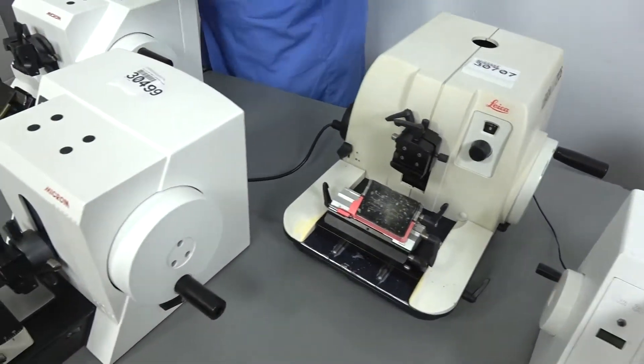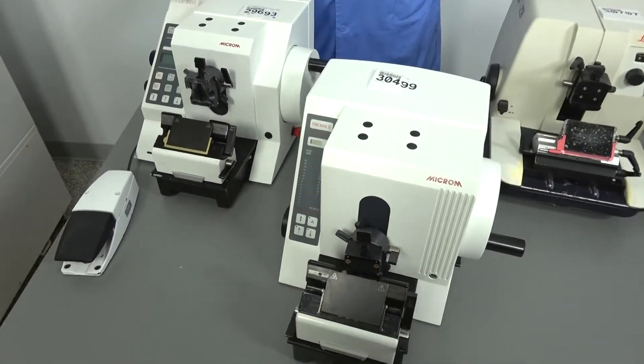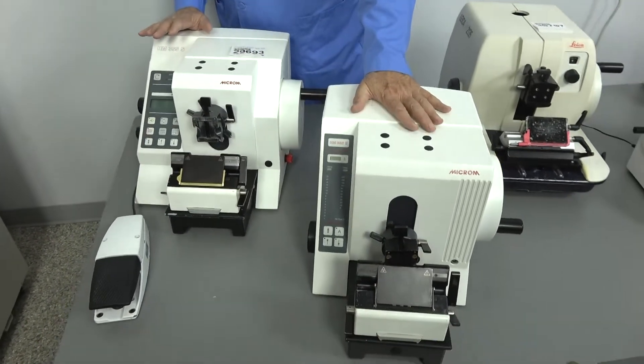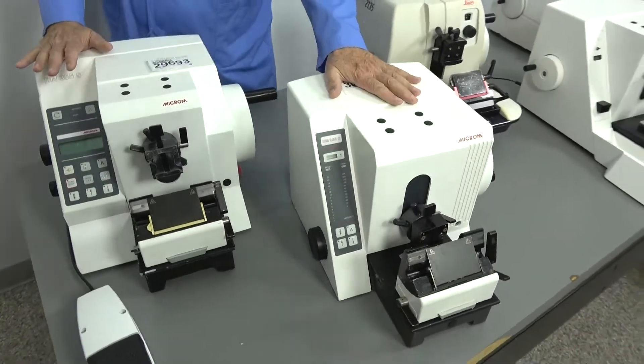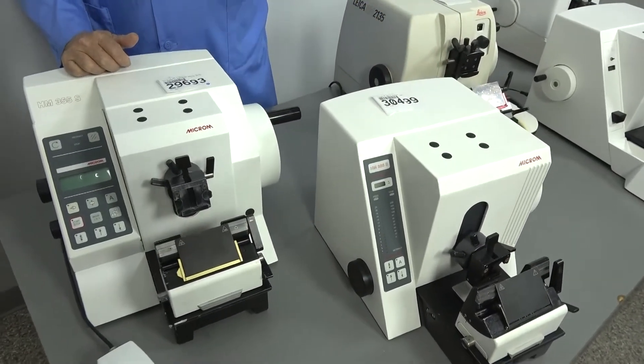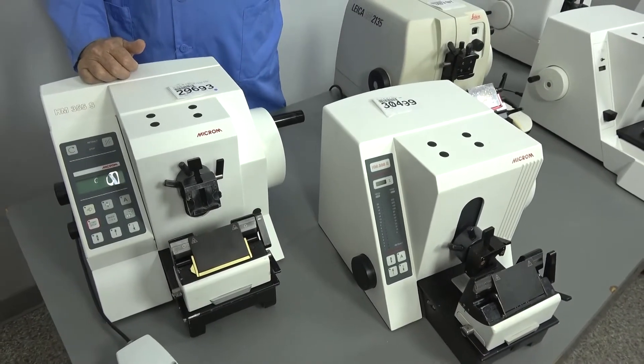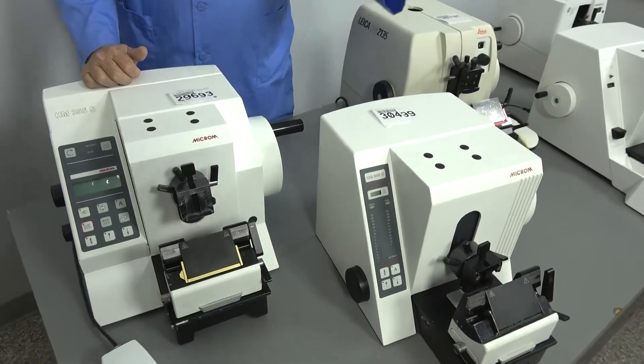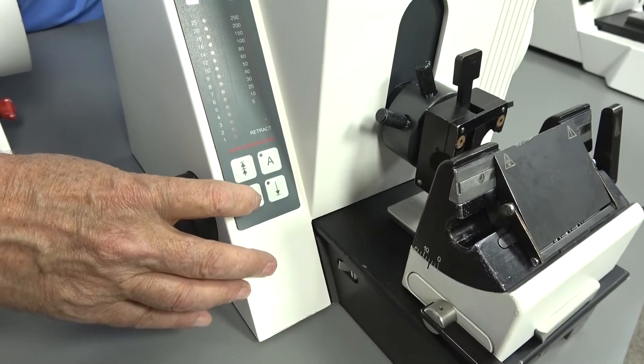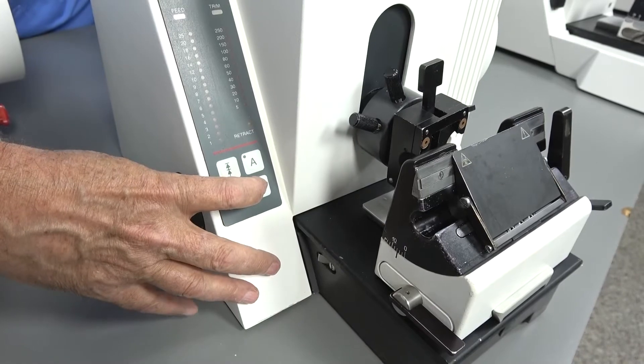Then we get into your entry into the electronic models. Those, as I said, were totally manual systems, power only to do the counter. When you get into the 325E, the E being the electronic, then you begin to get into electronically controlled motor and motorized advance and retract. So when you want to move the blade forward and back, it's done strictly on those buttons there.